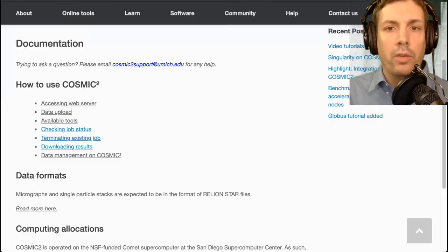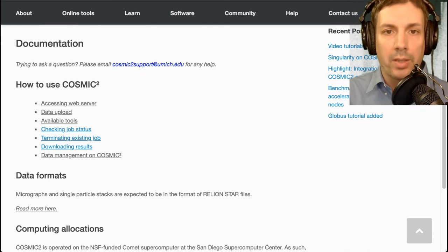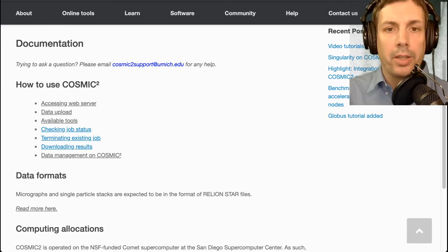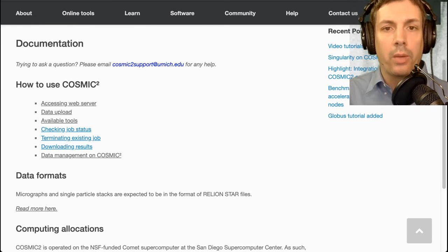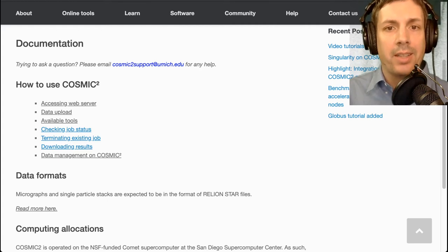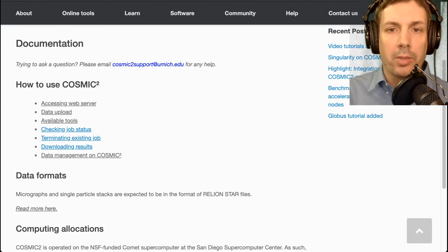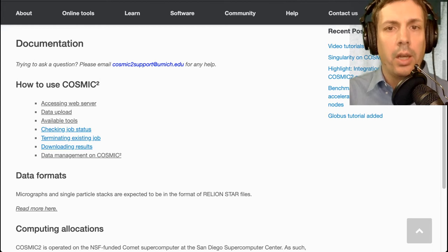In future videos I will show you how to do many of the following steps, including accessing our web server, uploading your data, working with our available tools, checking on submitted jobs, downloading your final results, and general data management on Cosmic Squared.